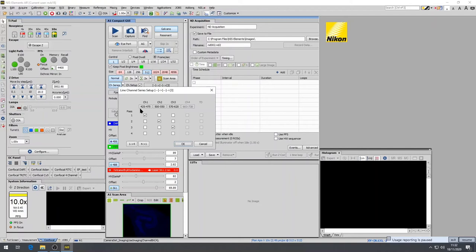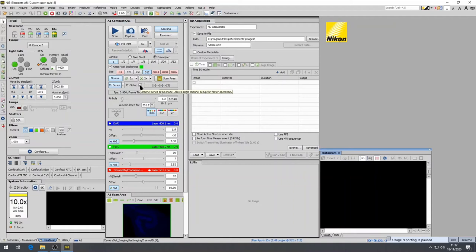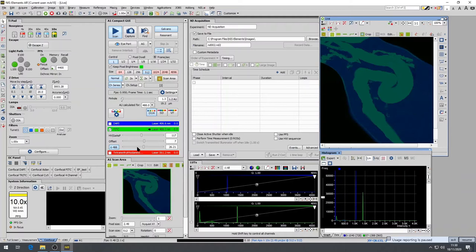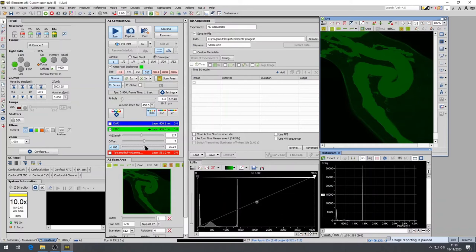Start with your brightest fluorophore. Usually the 488 laser is the one that is the brightest. Select it and then press scan on the top of the A1 compact GUI. As a good starting point, use the laser power between 1 and 5, though this depends on the strength of your fluorophore. And the photomultiplier PMT gain, which is named HV here, should be between 80 and 120.